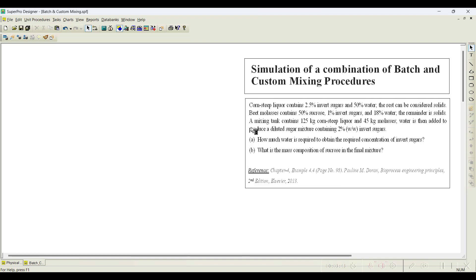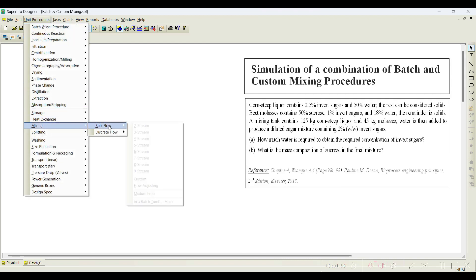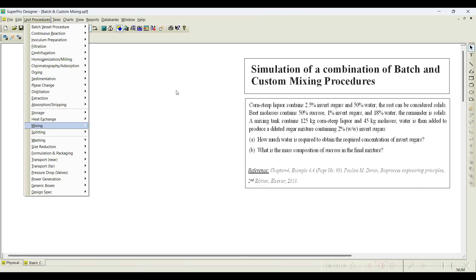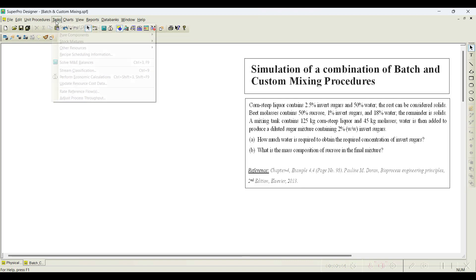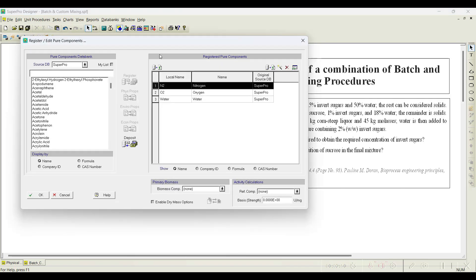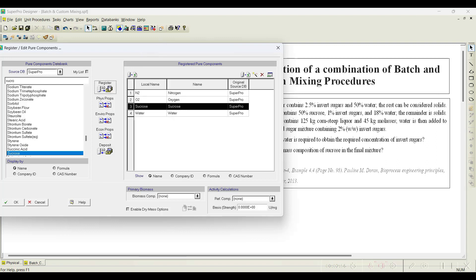We can use a mixing tank, but in SuperPro Designer we also have an option called mixing streams. Go to Unit Procedure, then Mixing — you can notice there is something called a Two-Way Mixer and also a Custom Mixer. Let us explore these options. First step: register the pure components. Go to Task, select Pure Components and Register. Among them, sucrose is available in the database — we will register sucrose directly. Invert sugar and solids are not available in the database, so we need to register them as new components.